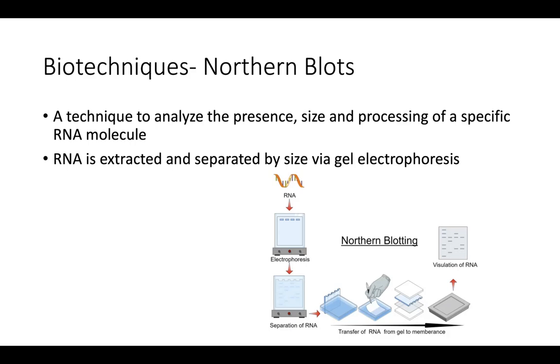I don't know if you've taken cell biology yet, but one of the things you should definitely be doing in your cell biology lab is learning about the process of gel electrophoresis and how you can separate samples based on size using an electrical field, okay? And so this is the northern blot, all right?